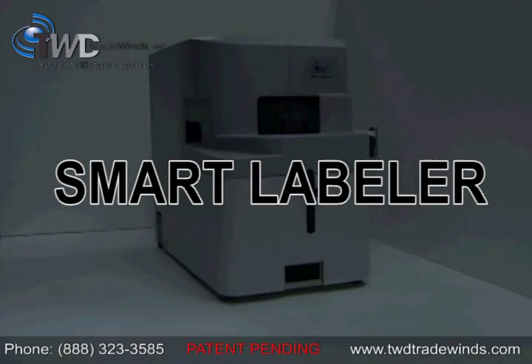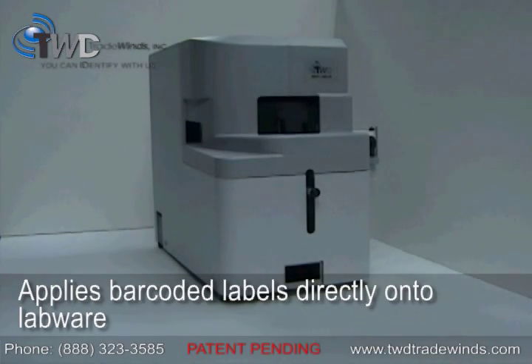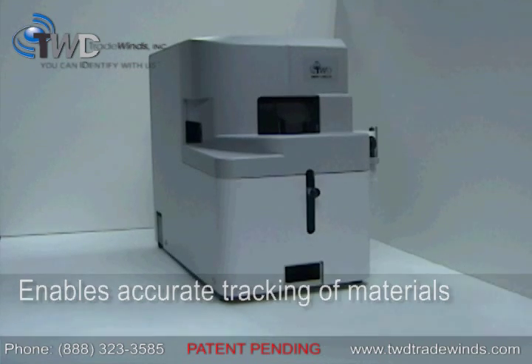TWD Tradewind's new Smart Labeler 1 applies barcoded labels directly onto your labware to increase lab efficiency and enable accurate tracking of materials, all at the touch of a button.